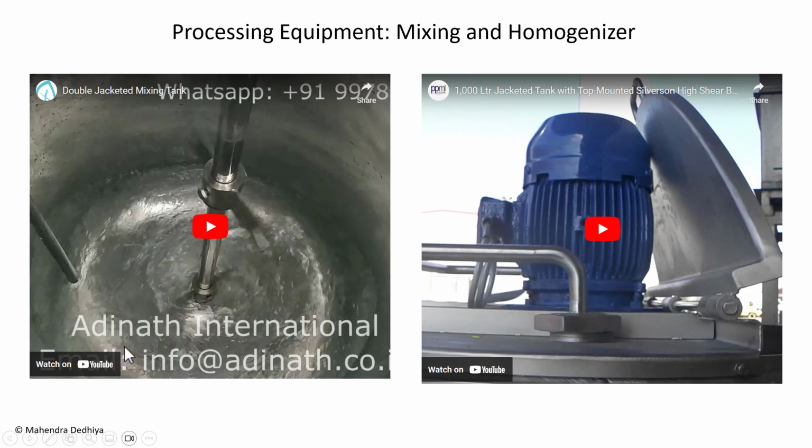The filtration has to be carefully used. Again, once we have a final suspended particles of active, we generally try not to use filtration unless we have a specific purpose such as sterilization.